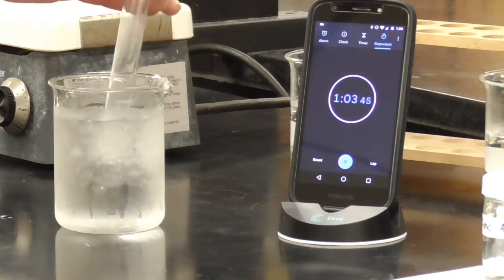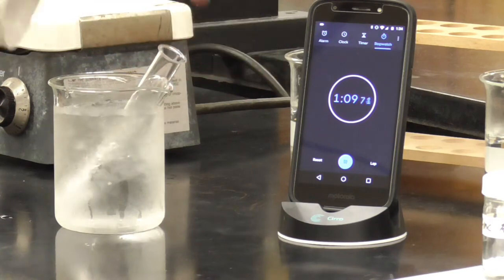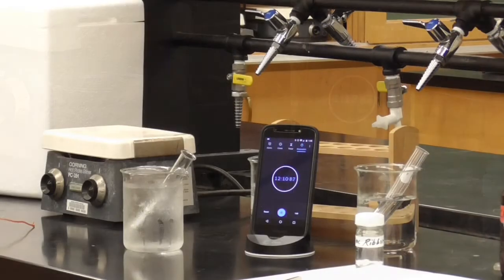See how this is going. We do have bubbling happening, but it's quite a bit slower. We're at 1 minute and 10 seconds here. What we're going to do is cut the video and let this go, and we'll come back when it's a little further progressed.